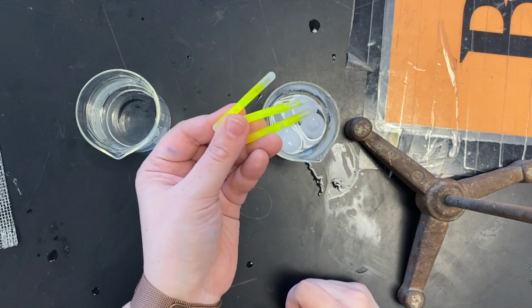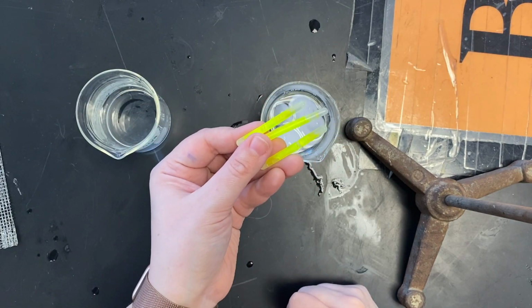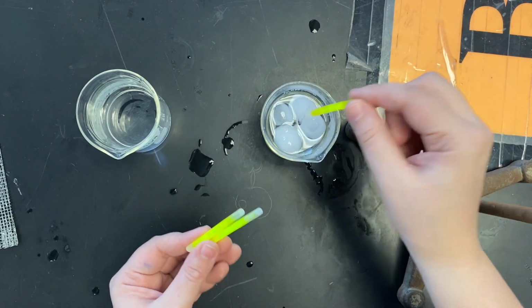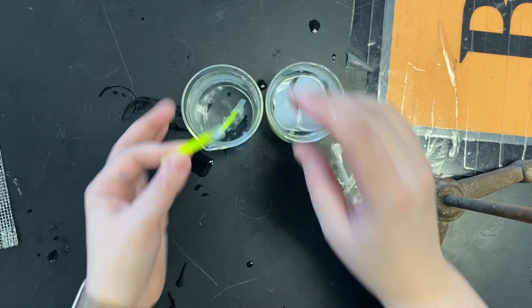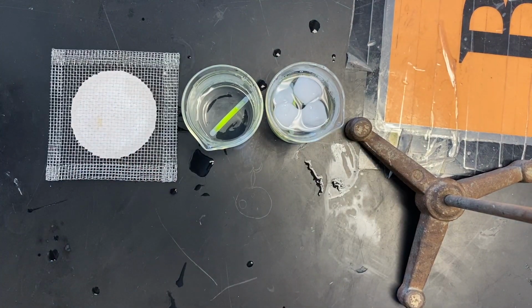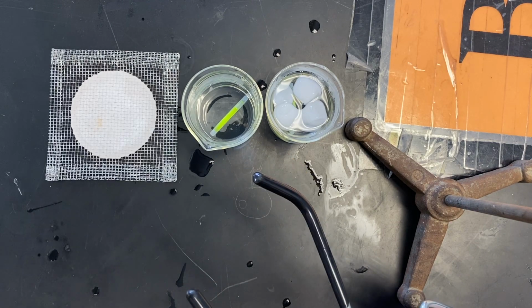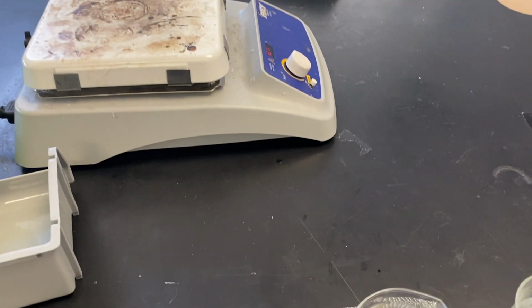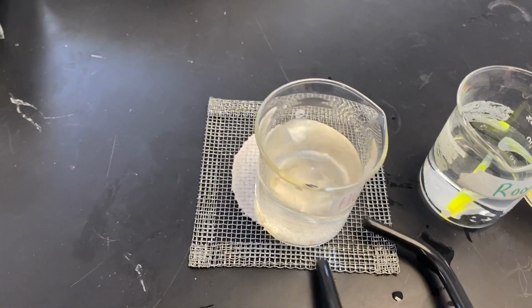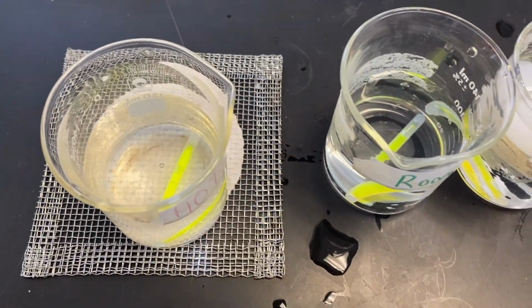Again, we can measure the rate of the reaction, the speed at which the reaction is happening by how bright these things are. So what you're going to do is take your glow stick, stick it in each of the beakers. At this point, your hot water does not need to be boiling as long as it's warmer than the room temperature. So you're going to take your beaker tongs, grab your hot beaker, put it on the cooling tray, and drop your glow stick in there.